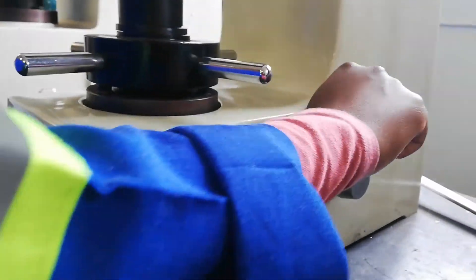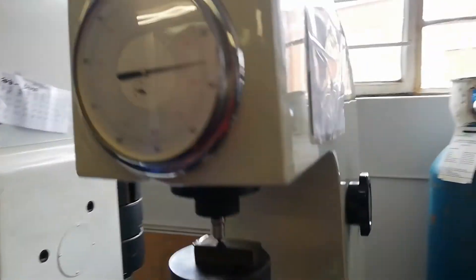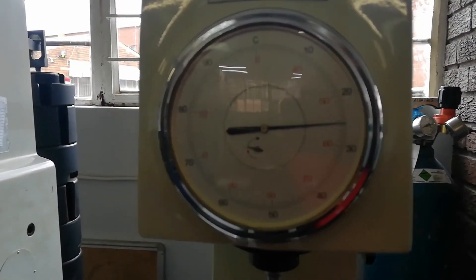Then we're going to put it back. She pulls back. Then we're going to get our readings. Can you see that?